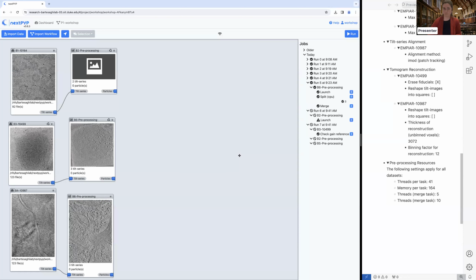Okay, great. Yeah, so then there's one question from somebody that is running on their own instance, and is asking whether, when they import data, it needs to be in the project directory or whether symbolic links can be used. Symlinks are fine. I use them a lot. That way I don't have to move data around.